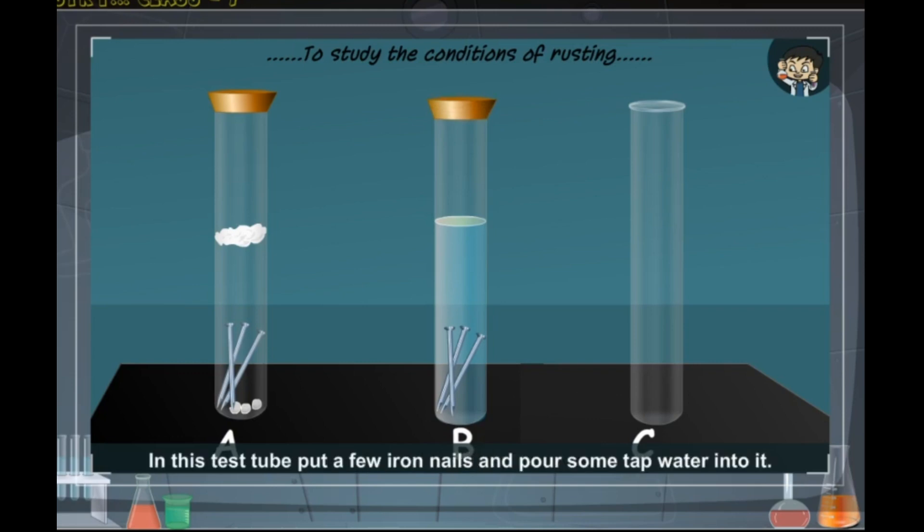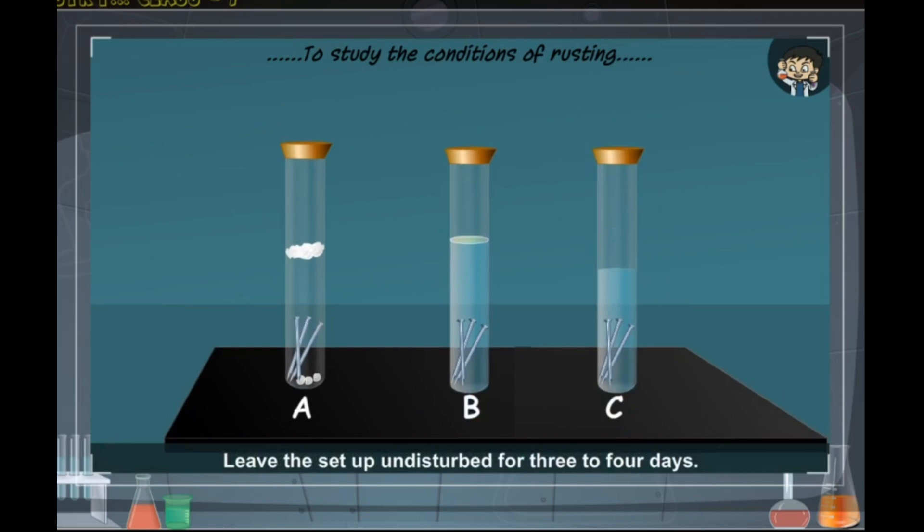Test tube C: In this test tube, put a few iron nails and pour some tap water into it. Close the test tube with a rubber stopper. Leave the setup undisturbed for three to four days.